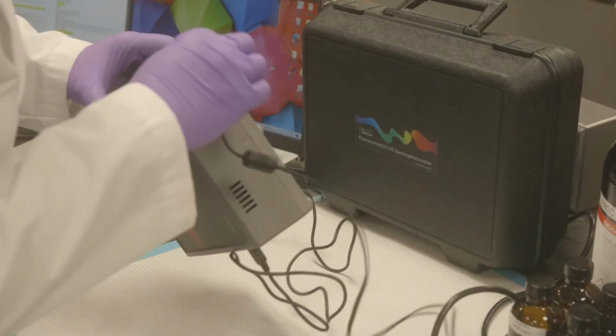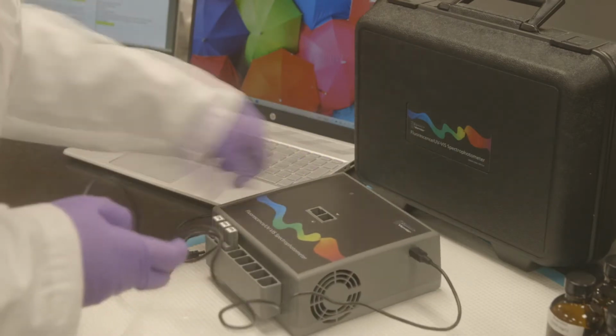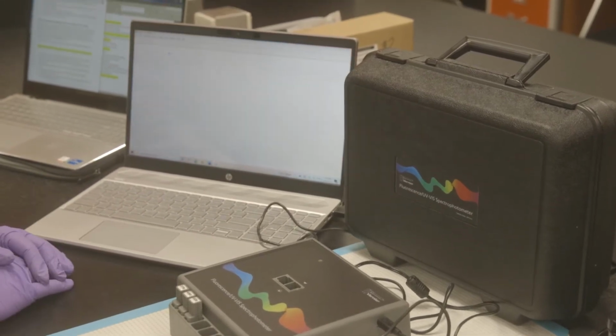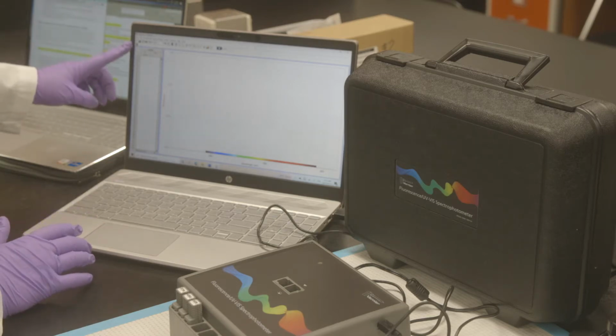The cord attachments include the power cord and a USB cord that allows for data collection using the software, Logger Pro 3. Once all cords have been attached, the software can be opened on the computer. Here, the instrument will register as connected in the top left corner and a blank graph will appear. Quartz cuvettes are used to record the absorbance in each of the samples.